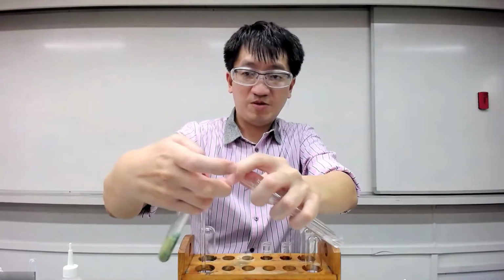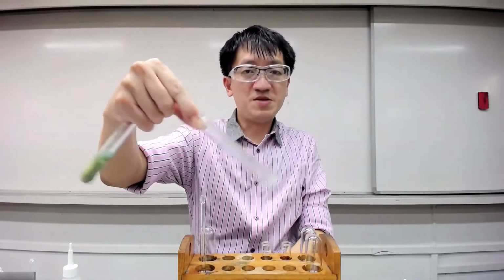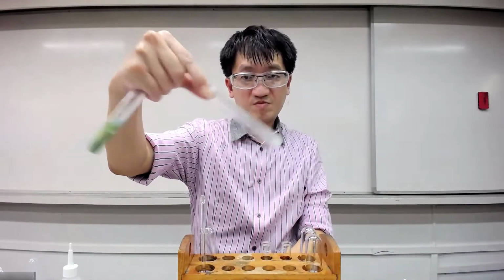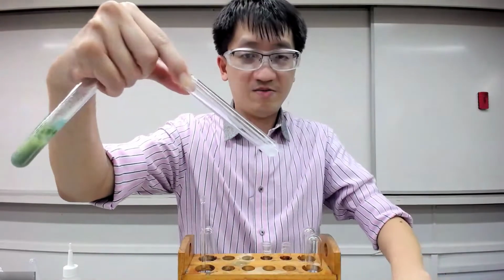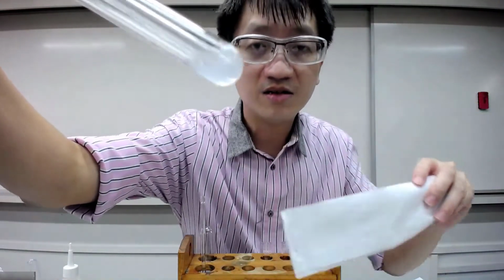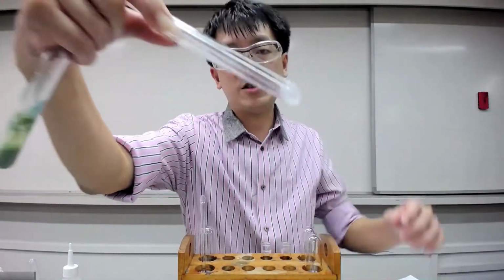Okay, so make sure you plug it in properly, because if not, the CO2 given out will not be able to give you the PPT you want. Okay. What did we observe now? Can you take a look? Maybe is it very obvious that you are getting a cloudy, milky solution containing white PPT? Yes. Okay, so I think we can stop here.